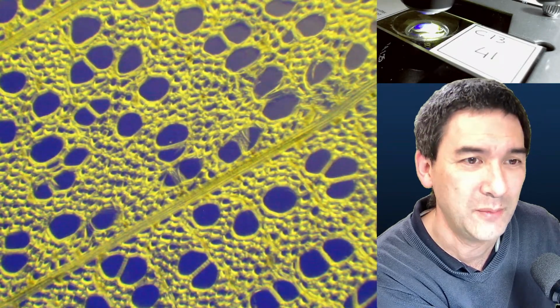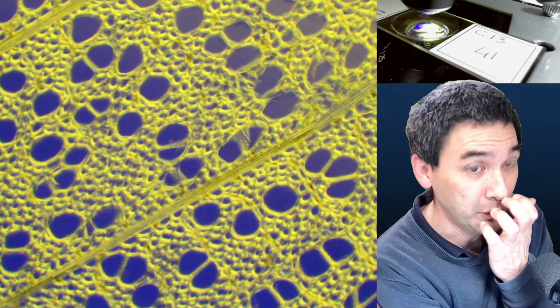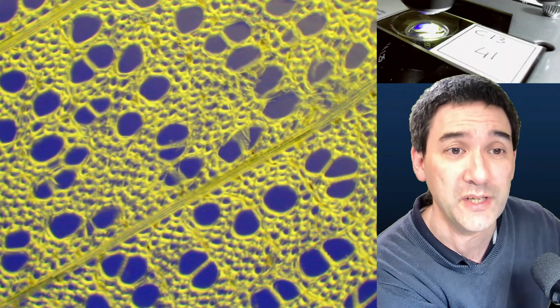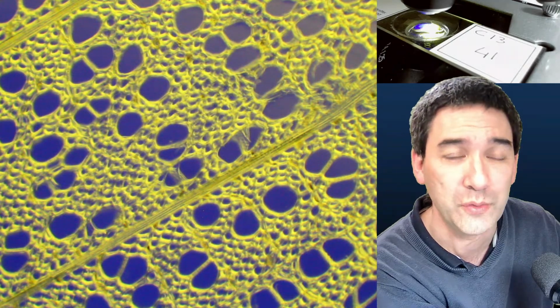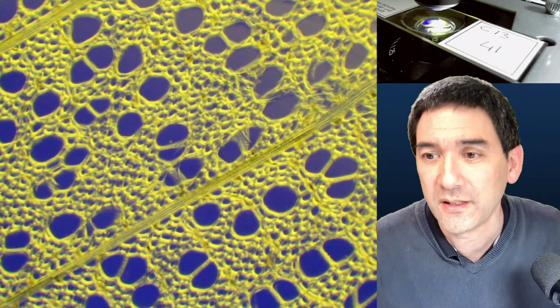And I know I'm repeating myself, but it looks so much better when looking directly through the microscope. There is indeed a little bit of loss of resolution because I also had to zoom in quite a bit to make sure that the camera image fills nearly the whole screen. So really try it out. It's really quite nice.